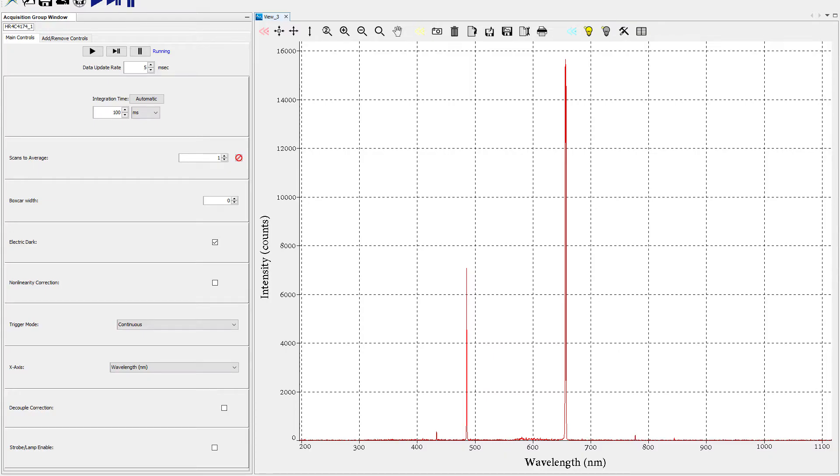In this experiment, you will be measuring the emission spectra from hydrogen and deuterium lamps using an ocean optic spectrometer and software. Shown here is an example of the data you will collect. The two brightest peaks at 656 and 486 nanometers are visible. You'll have to adjust the acquisition time and other settings to measure all of the peaks in the visible spectrum.